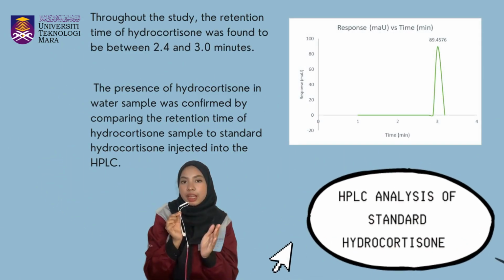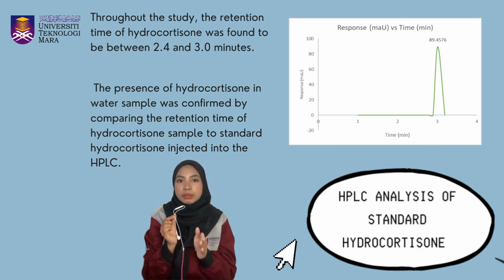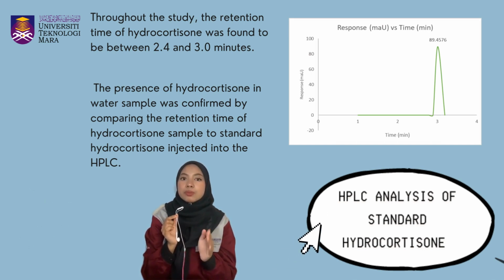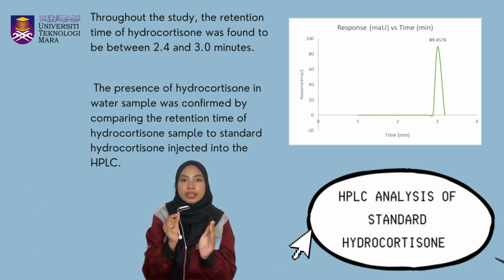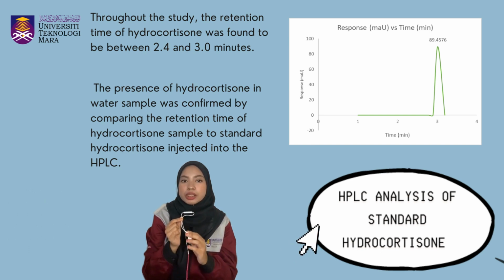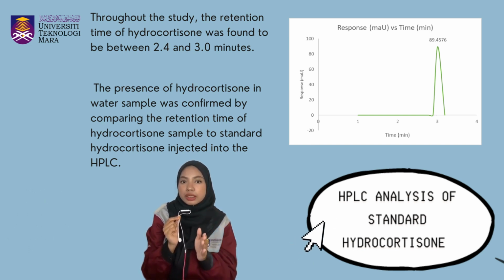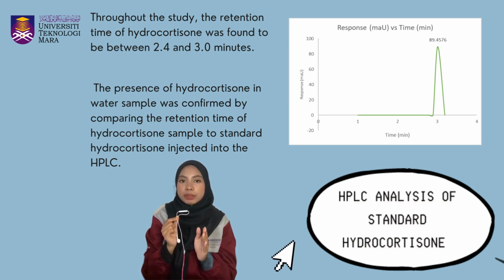The retention time of hydrocortisone was found between 2.4 to 3 minutes. The peak was prominent and sharp, indicating that the HPLC condition was successful. The presence of hydrocortisone in water sample was confirmed by comparing the retention time obtained in sample with standard injected into the HPLC.